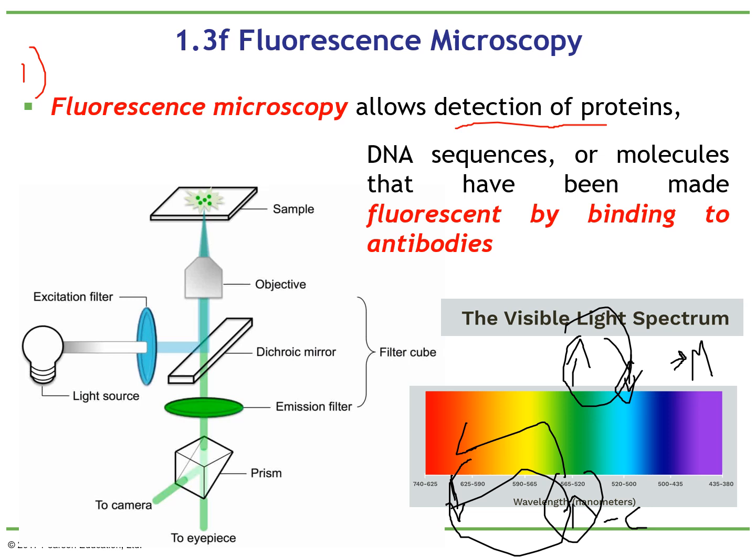Okay, the other thing that we talked about, and I am sure that you remember it from the video, is that you can put fluorescent proteins in the DNA, and this is how we do it. I'm going to show you later, if you haven't seen some of my movies, that we do that. So we're able to put that at the DNA level, and we can also make stainings of that. And in the next slide, I will show you how those stainings work.